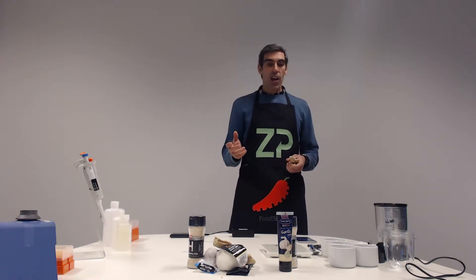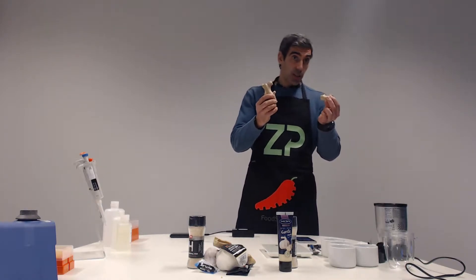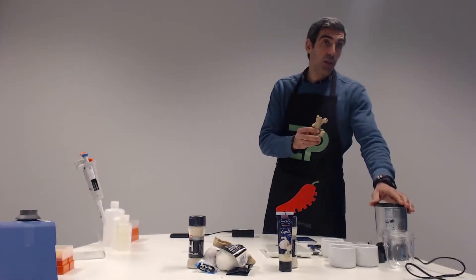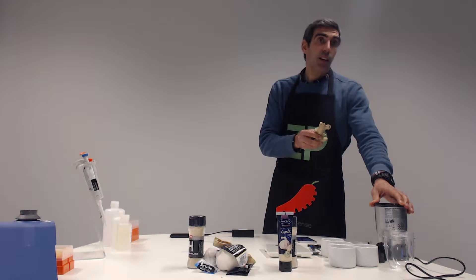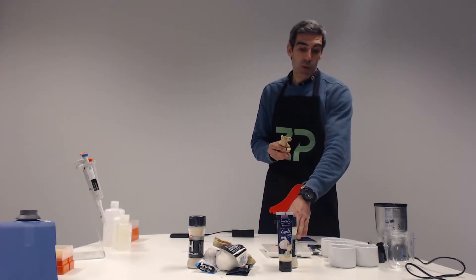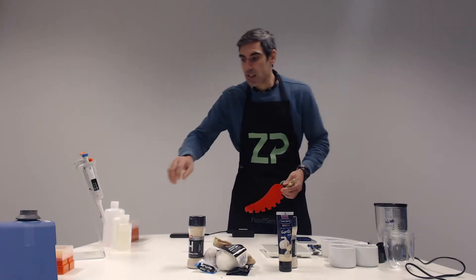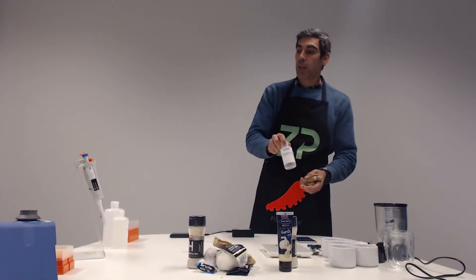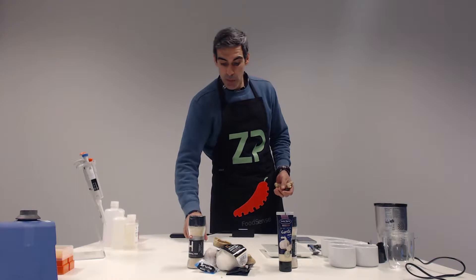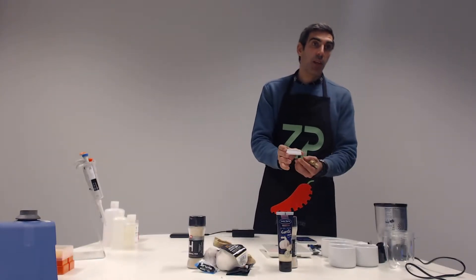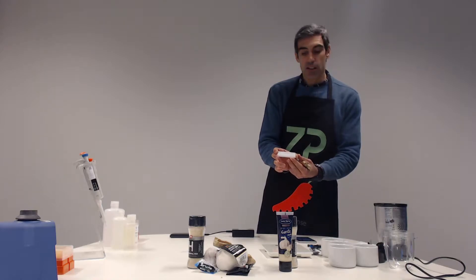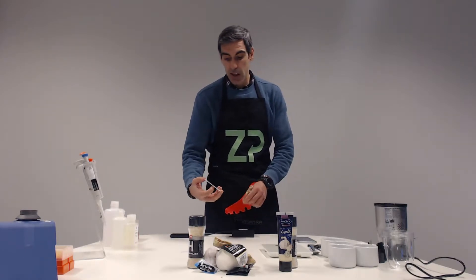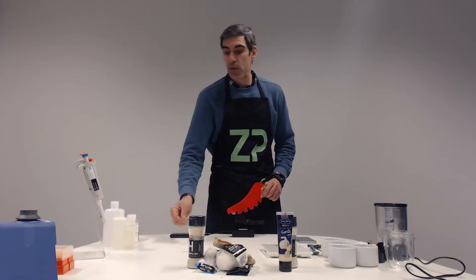For doing that we have ginger root which we are going to process in a grinder, in a food blender, and from that we will weigh one gram of that sample and mix it with a ginger pot buffer solution from our sister company, Alexia. Then we will apply it to one of our ZP ginger sensors and measure it. We'll connect it to our FoodSense device and measure it in our FoodSense app.